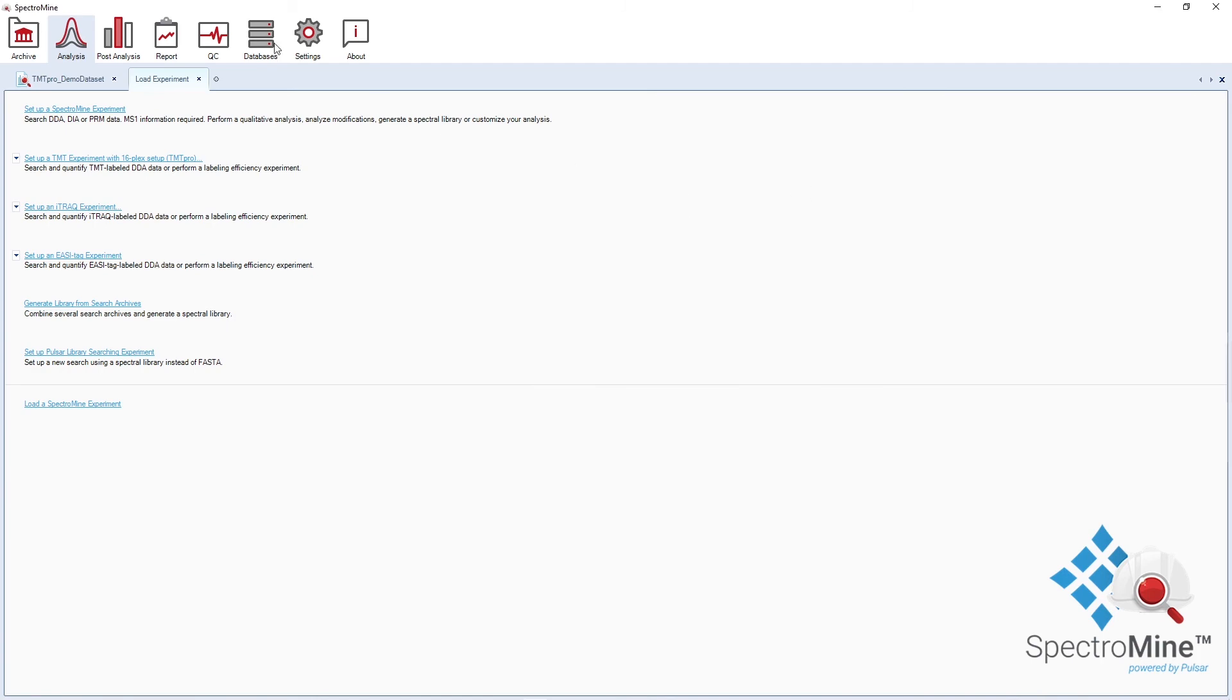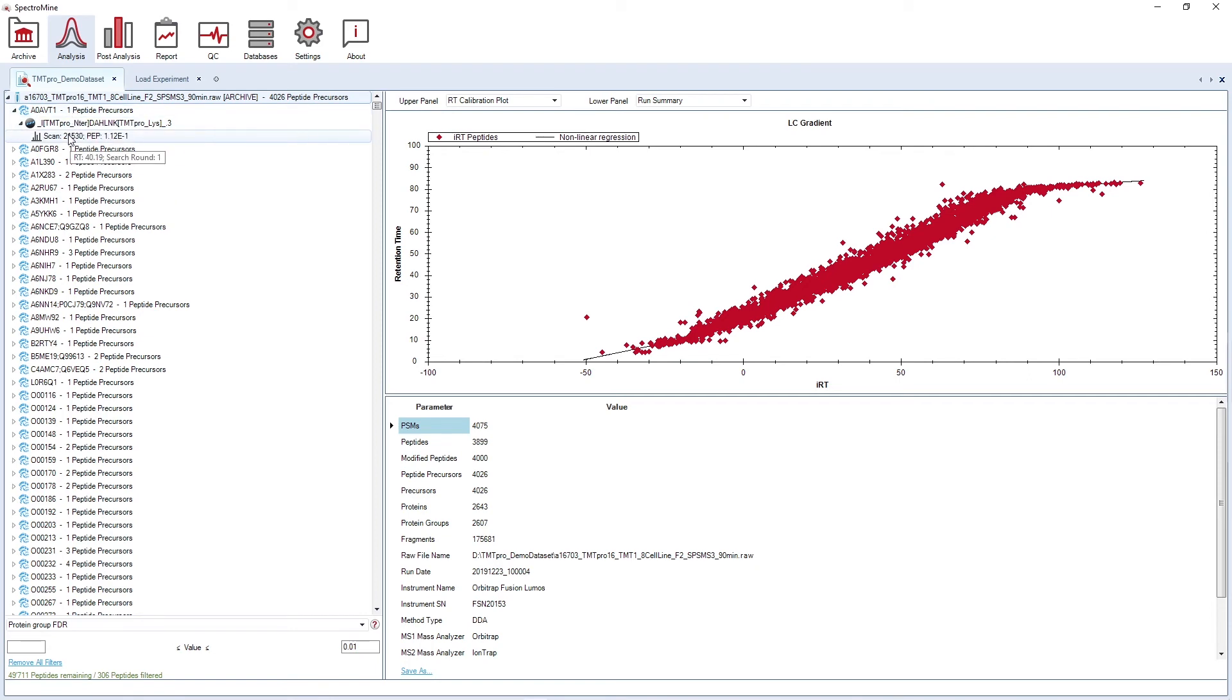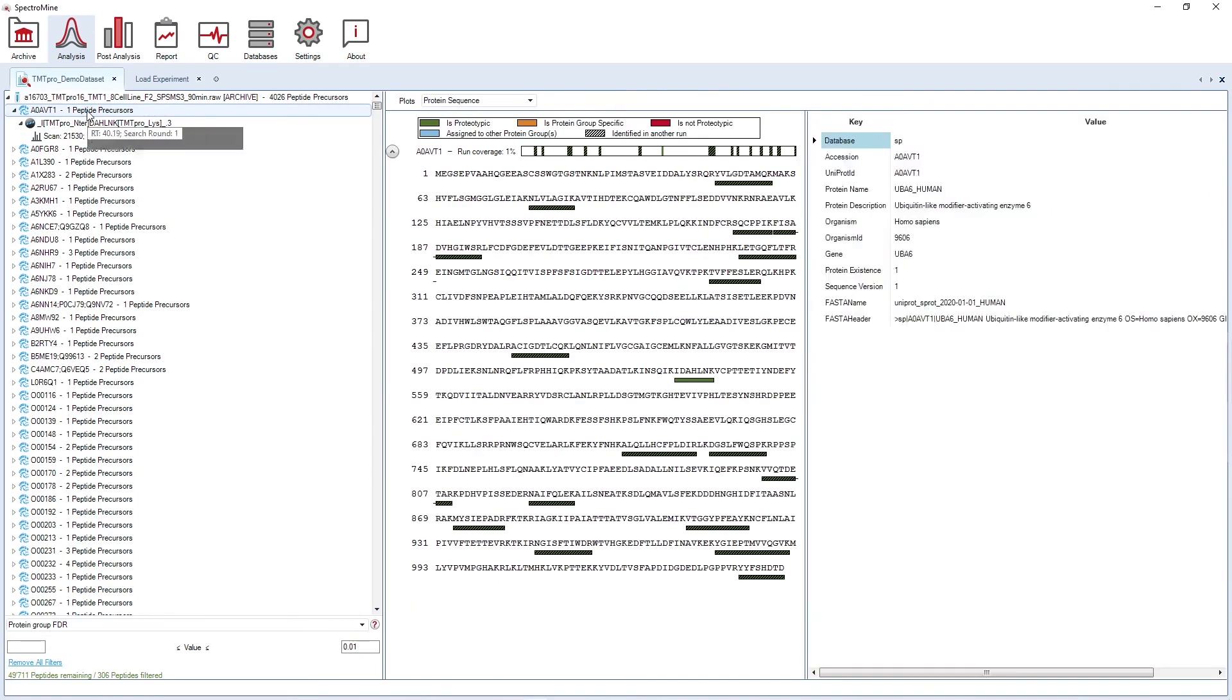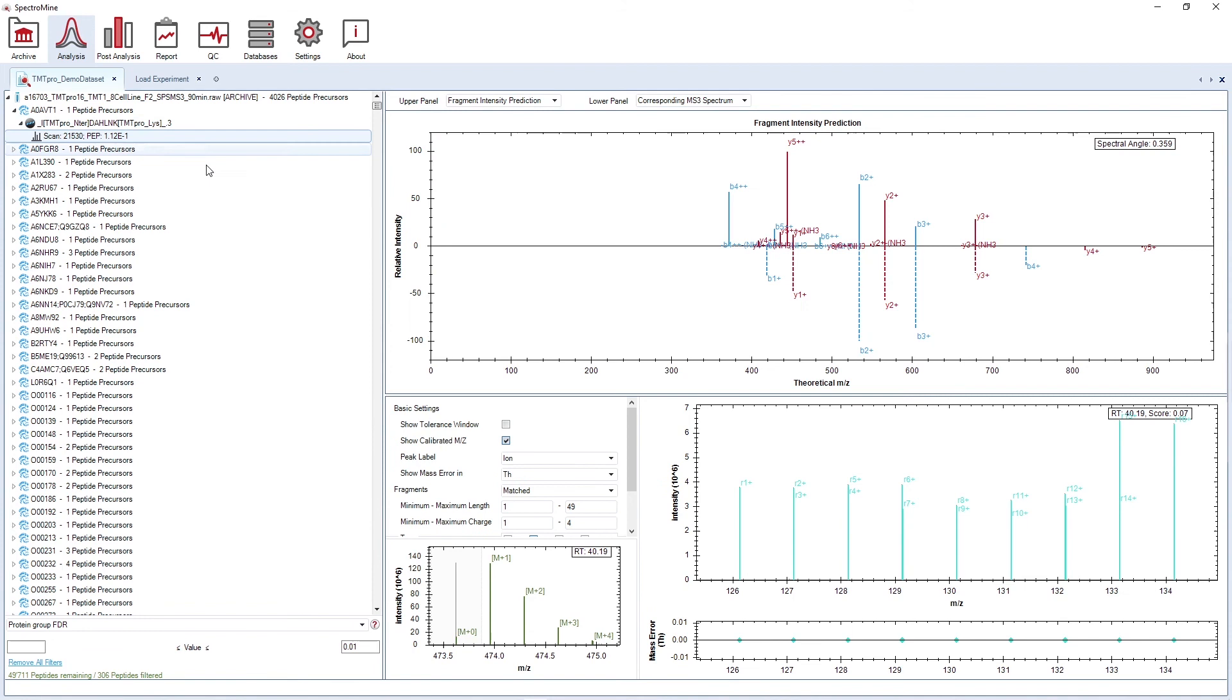Once the analysis is complete, this is how it looks like. You have the run, the protein, the precursor and scan level. At every level, you have different plots, such as the protein coverage, the best PSM, the fragment intensity prediction, and in case you have performed MS3 quantification, you have the corresponding MS3 spectrum.